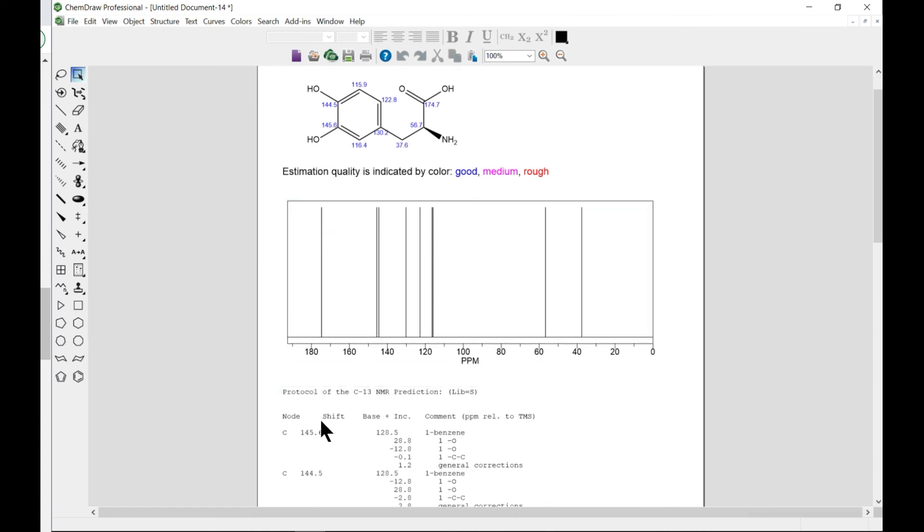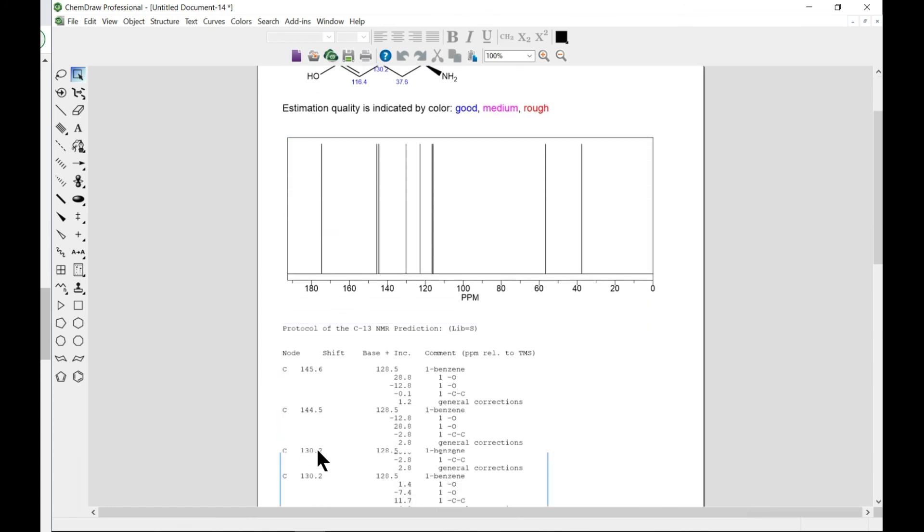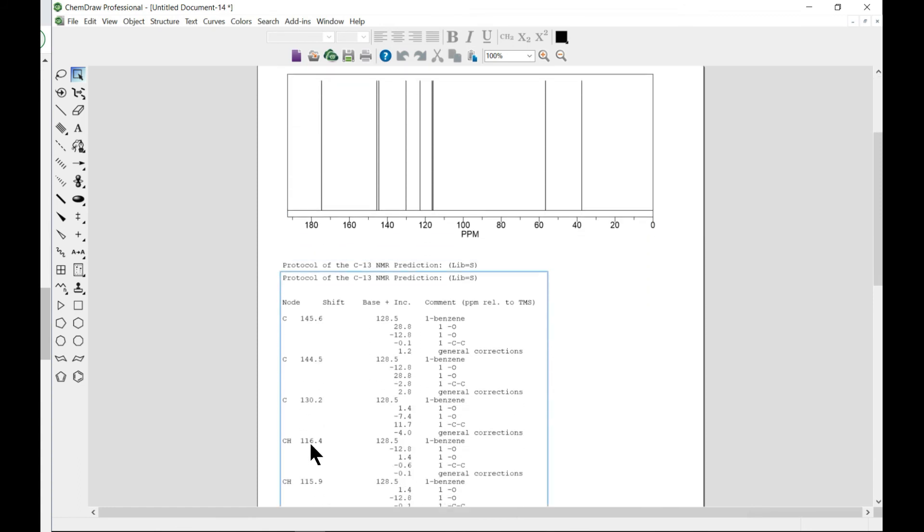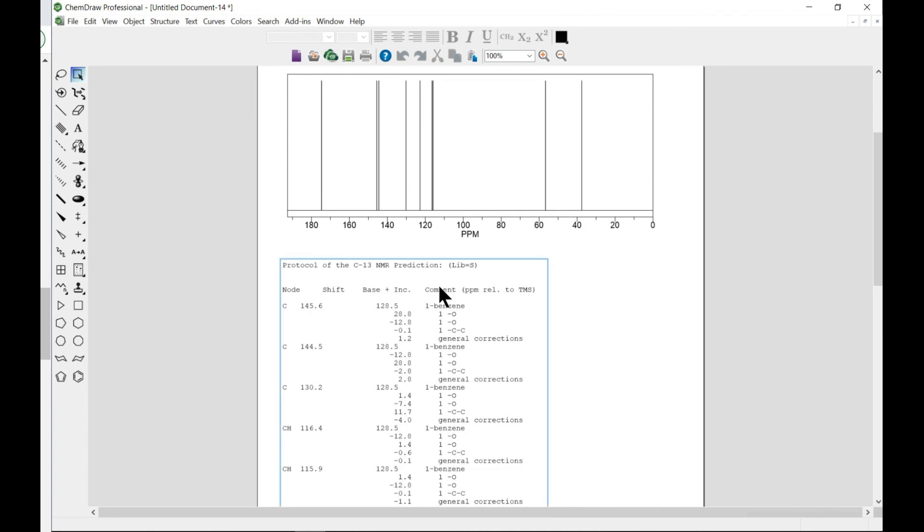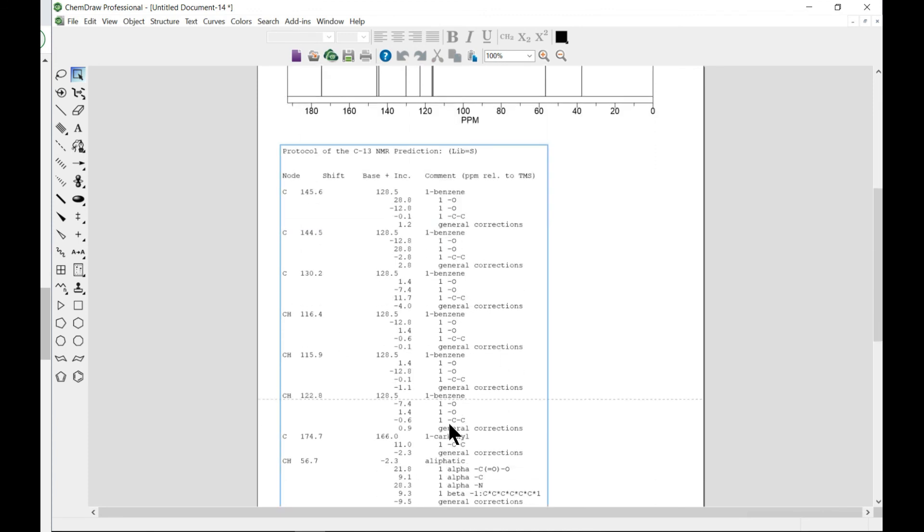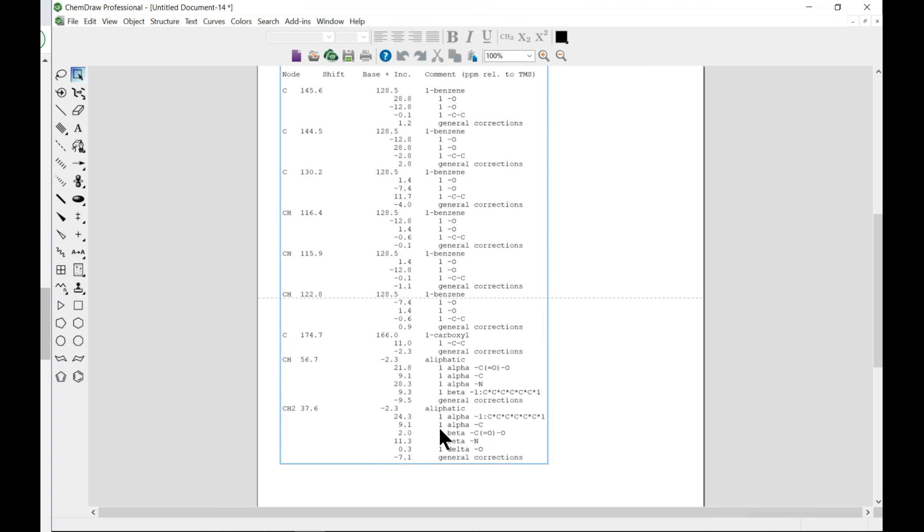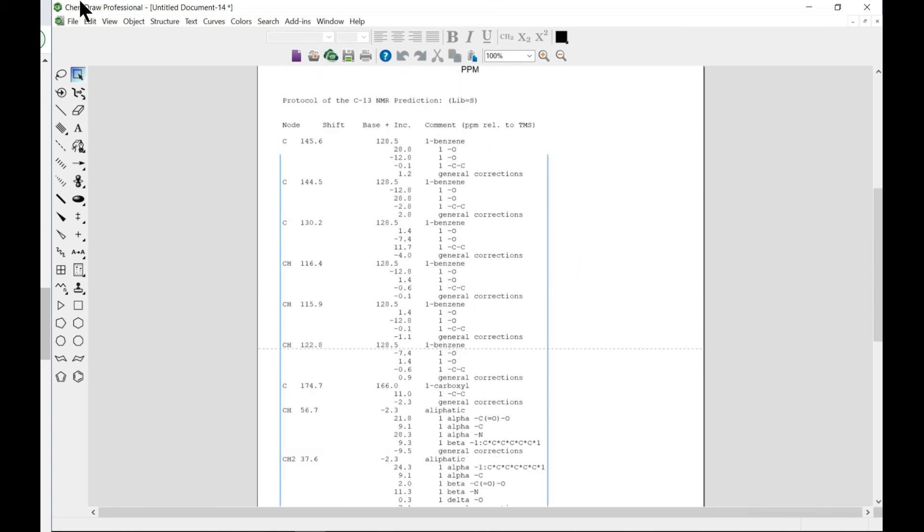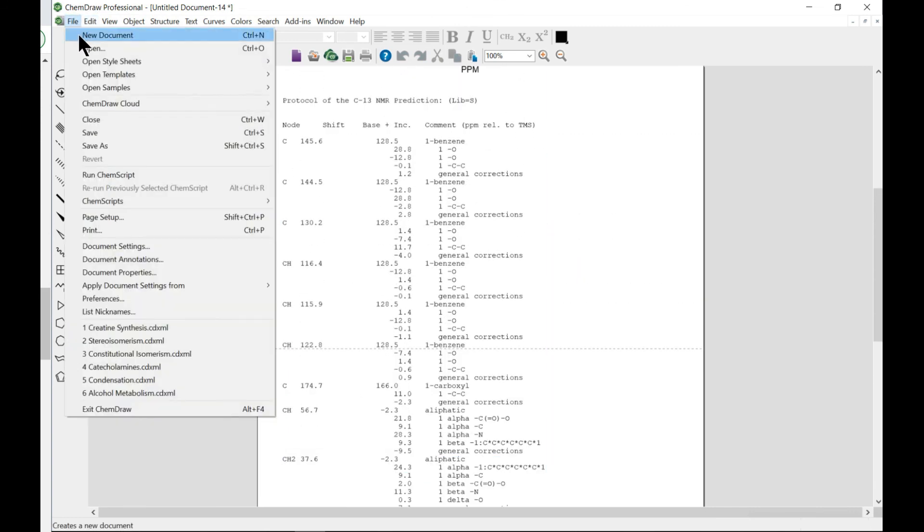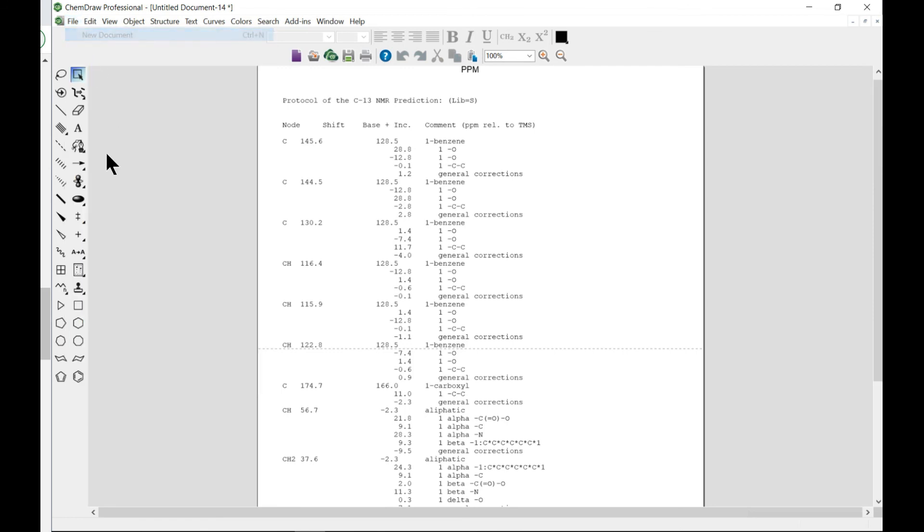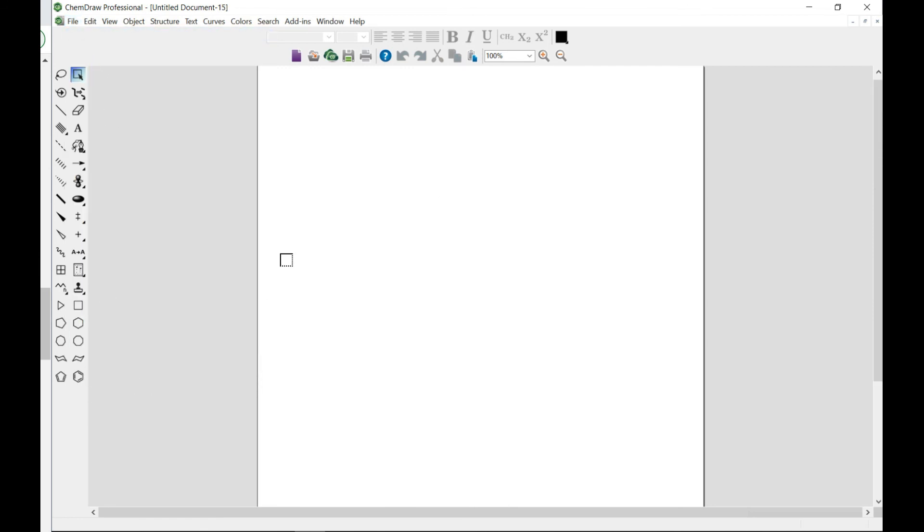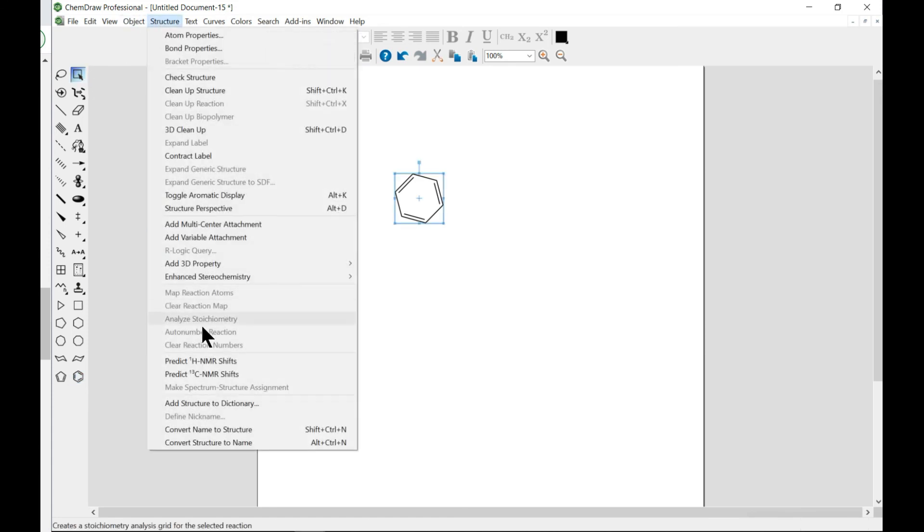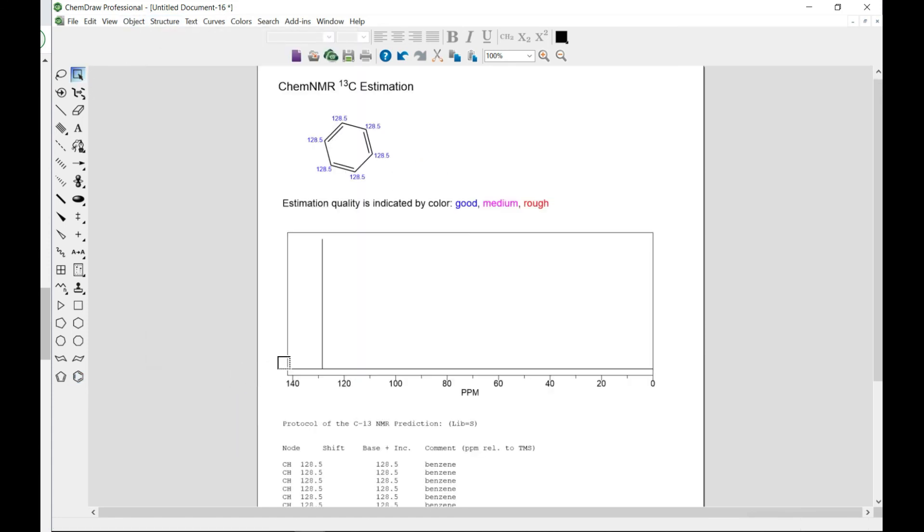And gives us the shift that we need and gives us the comment as we also desire. So you can draw your own structures and play around them. You can draw maybe just a regular benzene, select and predict the carbon.